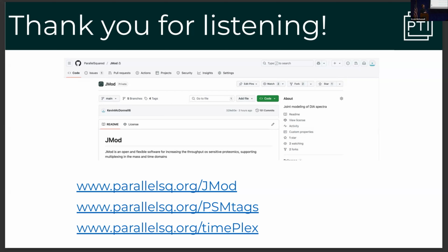Very nice talk, maybe not related to the software specifically. It's nice that it's open source though, I like that. But how easy is it to implement PlexDIA, if I would like to do it in my mass spec lab? Oh, I'm purely computational. You have to refer your questions to the mass tags team. They're scattered around here. They have worked a lot on optimizing and making it simple. I think that's one of the things we want to do, make this accessible to everyone. I can't give you a more detailed answer than that this is something we're strongly looking at, trying to optimize and release protocols so that it's easier to do.